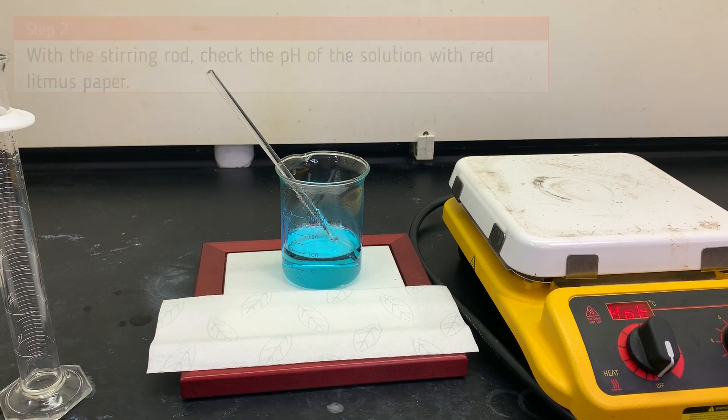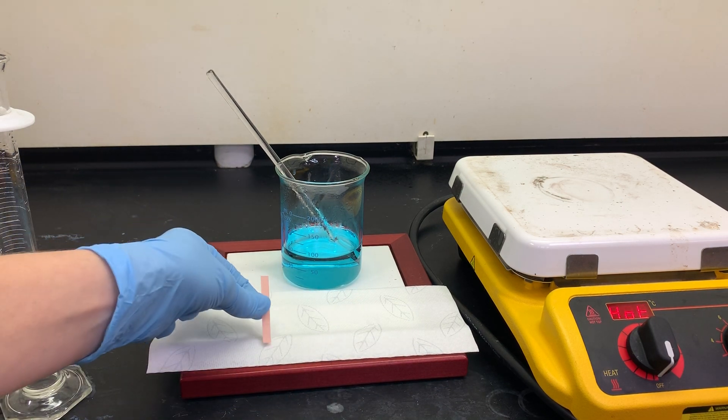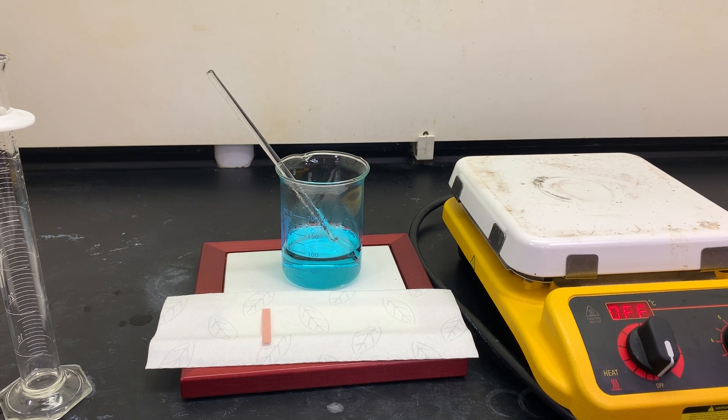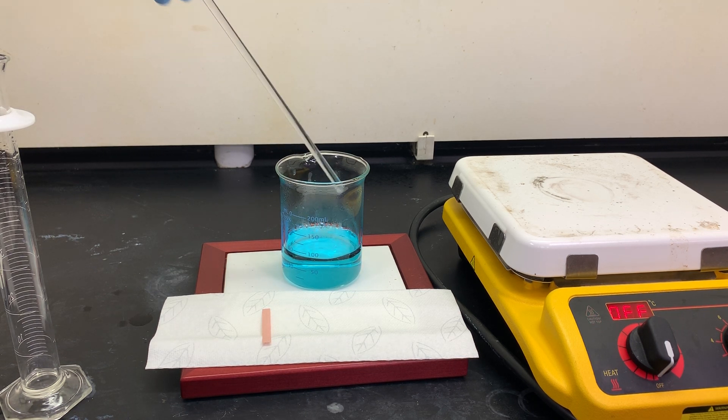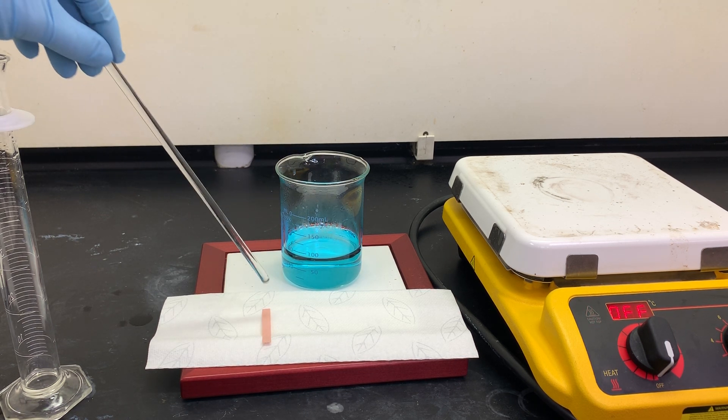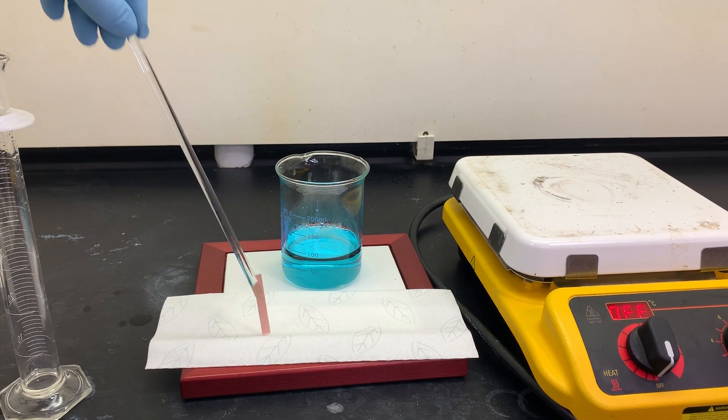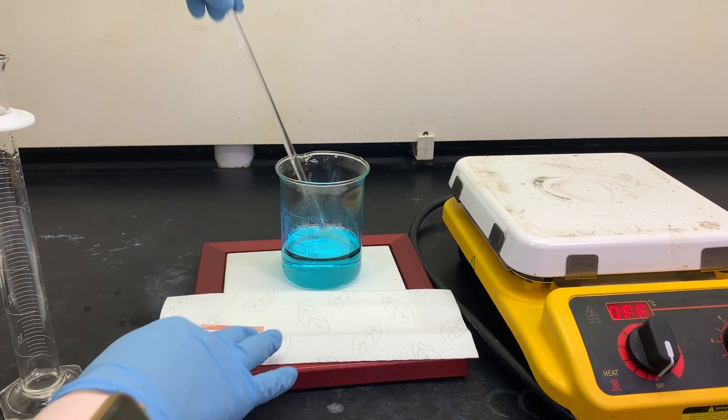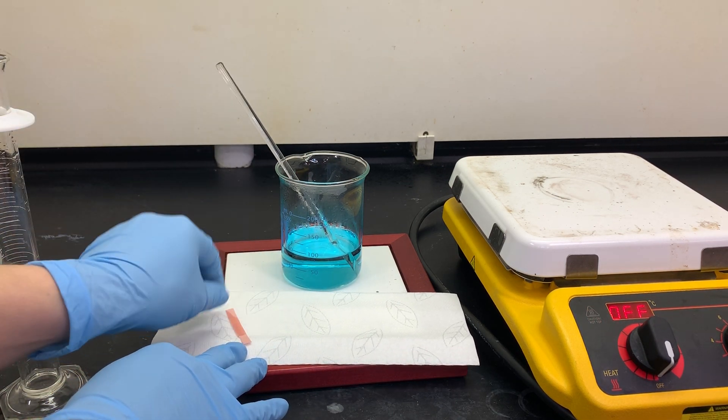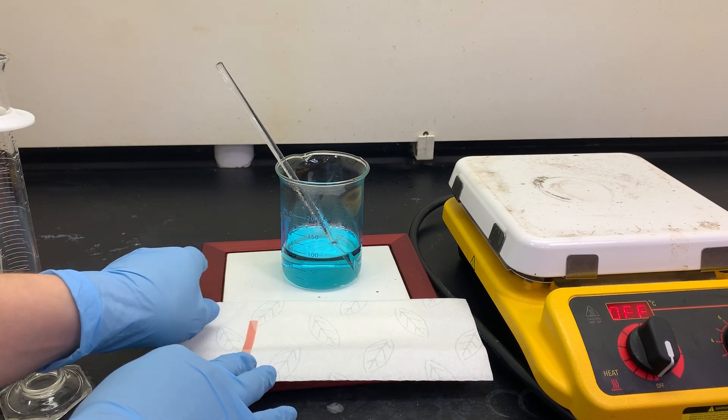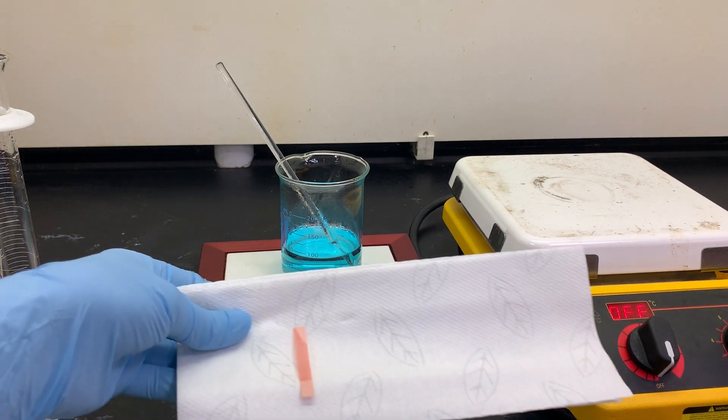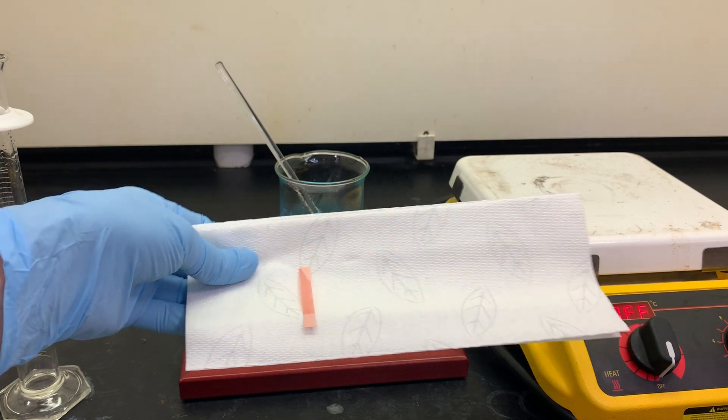Red litmus paper turns blue in a basic solution and stays red or pink in an acidic solution. What type of solution do we have here?